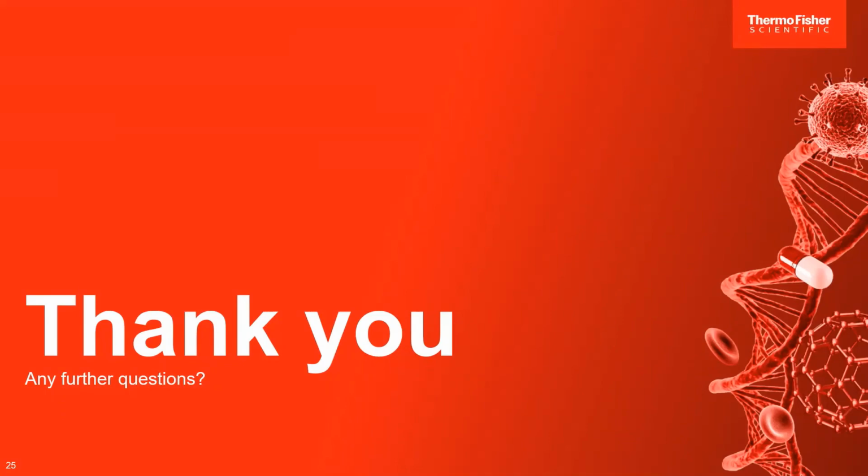I know everybody is so focused on COVID right now that we tend to forget that the equipment we have is just that. It's equipment. It's a tool that's designed to look at, in this case, DNA. And really speaking, it doesn't matter where we get the DNA from. Your equipment's still going to look at it. In terms of next generation sequencing, your input is DNA. Whether that's human DNA analyzing your metabolome or transcriptome, or microbial DNA coming from a complex environment such as a mine, where you could look at individual organisms responsible for acid mine drainage, all of these instruments would do the exact same thing.